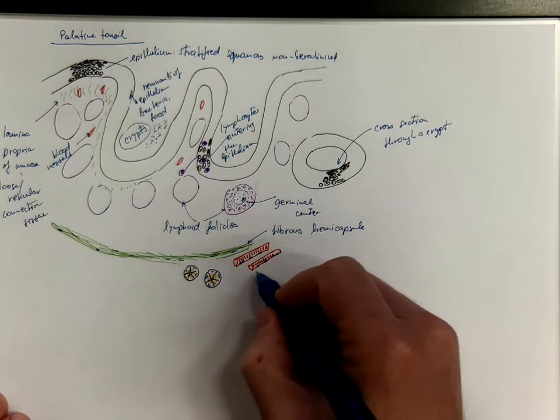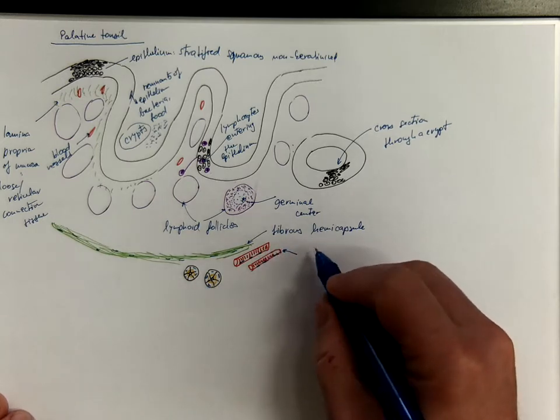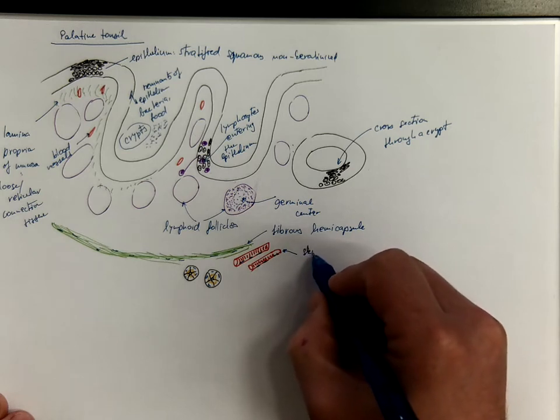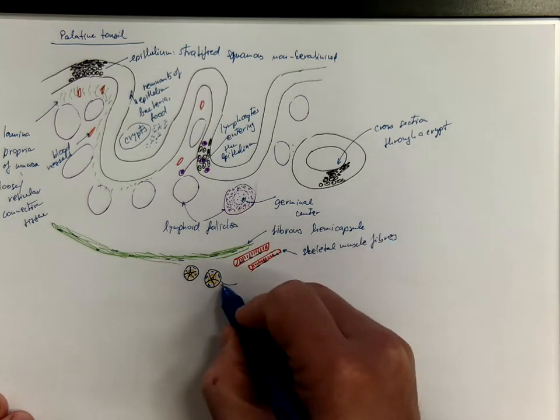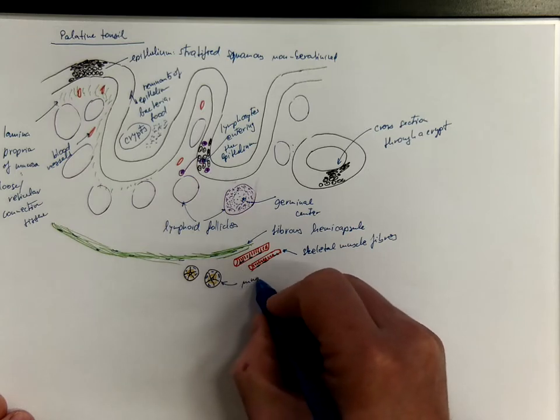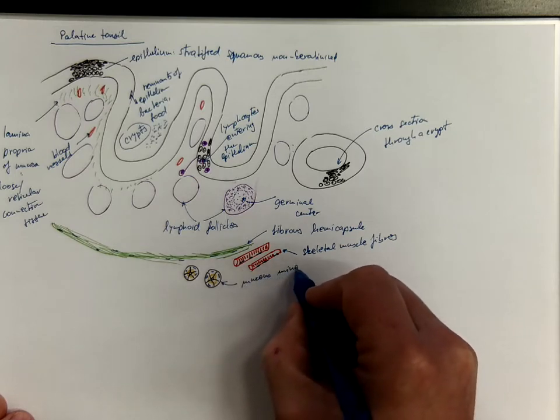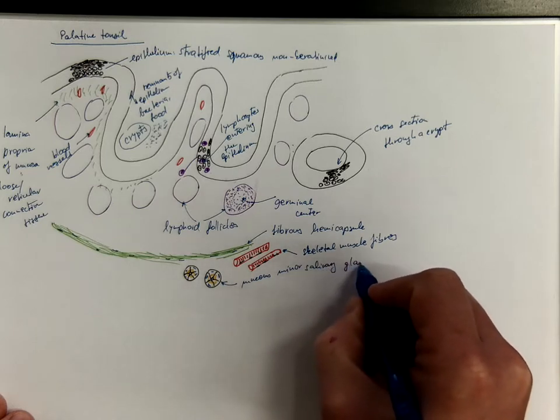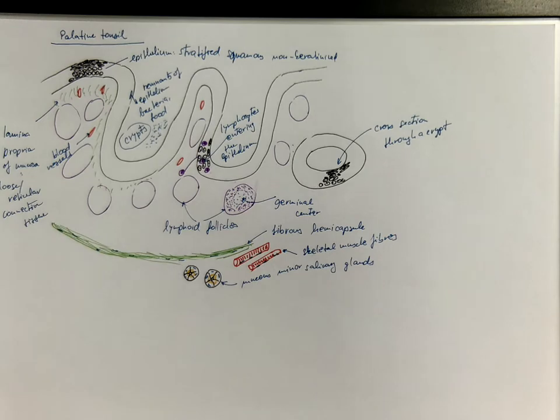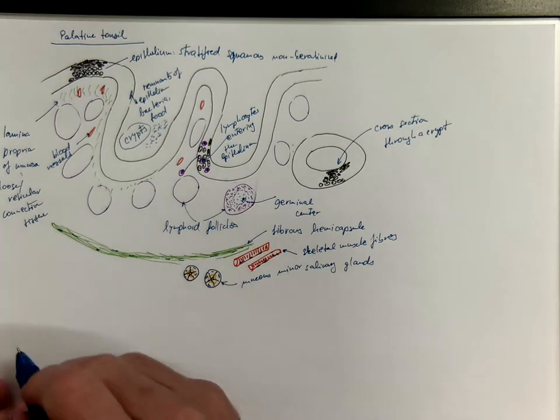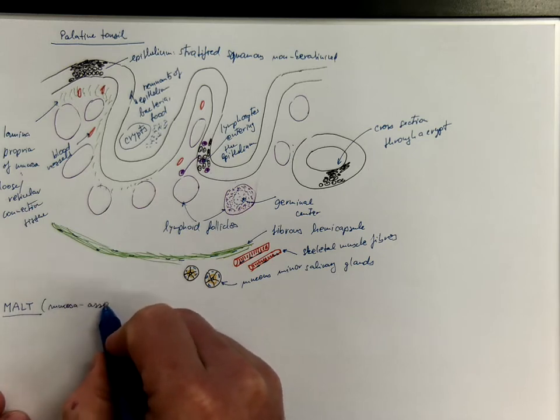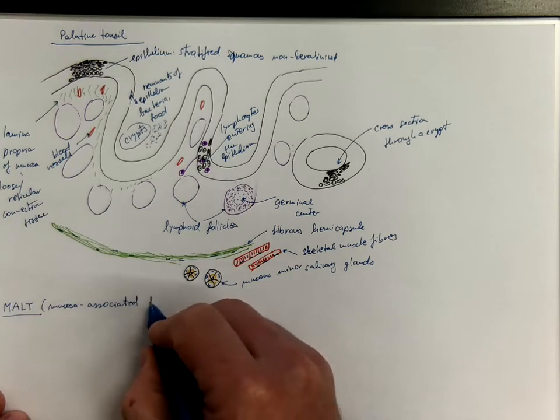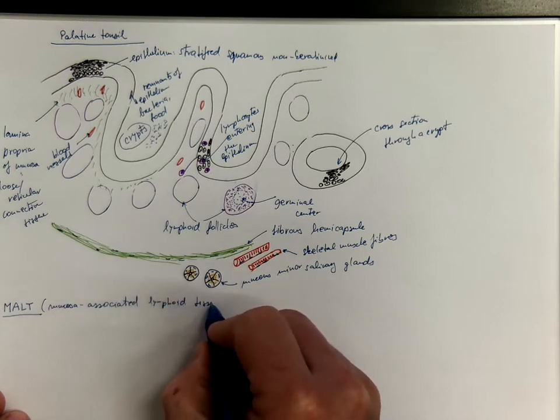And there is the fibrous hemicapsule with mostly fibrocytes and fibroblasts. And these are already the structures occurring in the surrounding tissues. So that's the skeletal muscle fibers and mucus minor salivary glands. Palatine tonsils are part of the so-called MALT, which says mucosa associated lymphoid tissue.